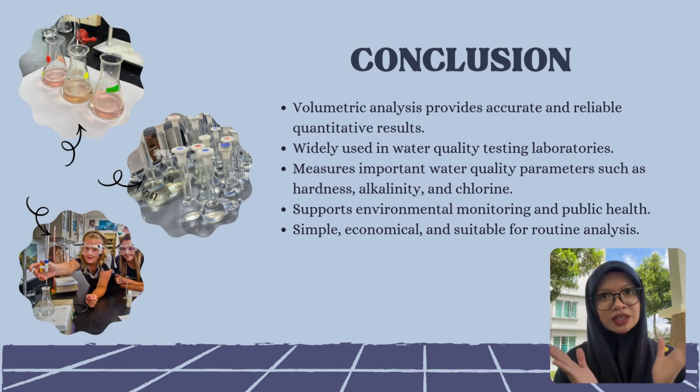industrial use. In conclusion, volumetric analysis is one of the most important analytical techniques used in water quality testing. It provides accurate and reliable quantitative results by determining the concentration of substances through titration.